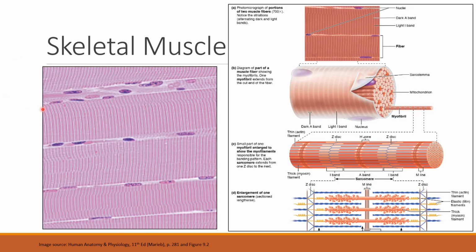Here's a close-up image of the skeletal muscle. So here's another microscopic image, the striations, the multiple nuclei here. But here's the comparison diagrammatically. Okay, so you have this picture up here on the top. You see the little bands, they call it an A band and an I band. But the striations are here, the nuclei here off the side.